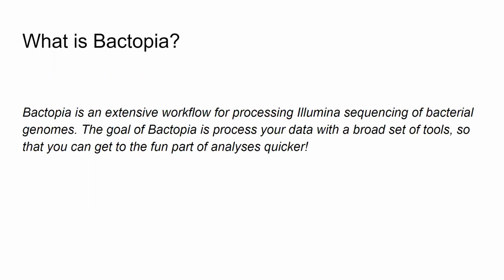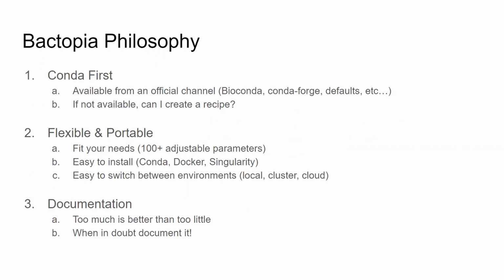So what is Bactopia? I describe Bactopia as an extensive workflow for processing of Illumina sequencing of bacterial genomes. The goal of Bactopia is to process your data with a broad set of tools so that you can get to the fun part of analysis quicker. Because I think we've all been there where you're slogging through the pipeline, and you're just like, I just want the output so I can start analyzing the data, and not deal with getting everything running and all that.